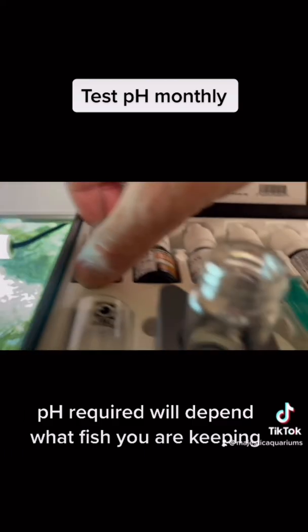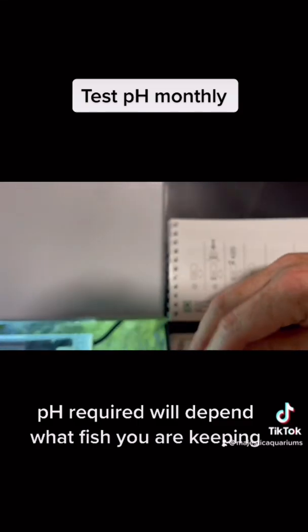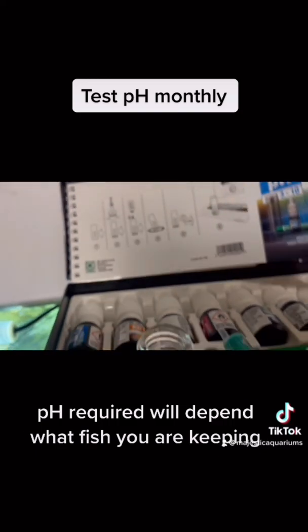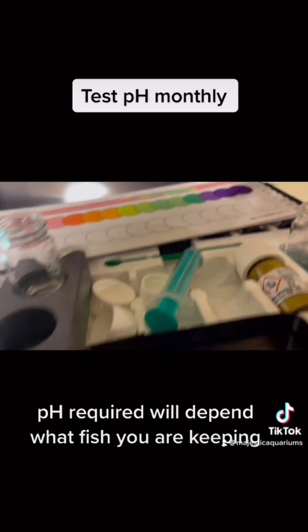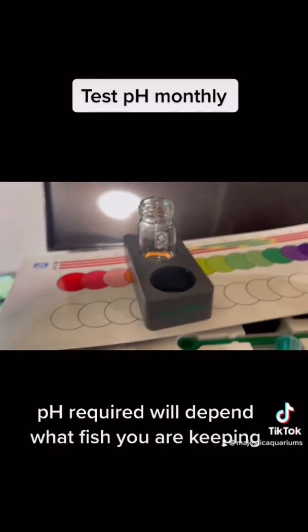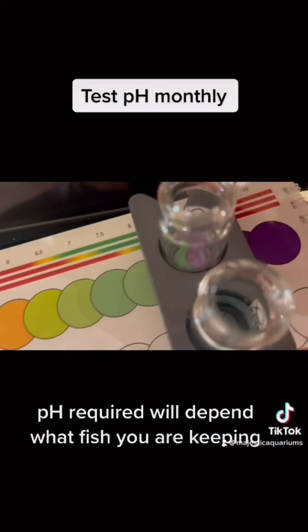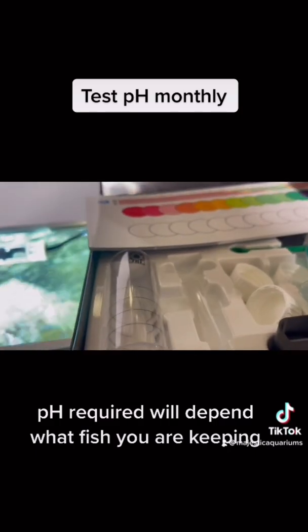So what I just did then is I got my pH solution, which is this one, pH, and I added the 5 drops. Then I give this a shaky. Then I just look at the color. So now I just flip this over. And if you want to get fancy, you can chuck this in there and then once again compare the color. So this one is quite blue. The colors always look different in my camera, but blue is good.